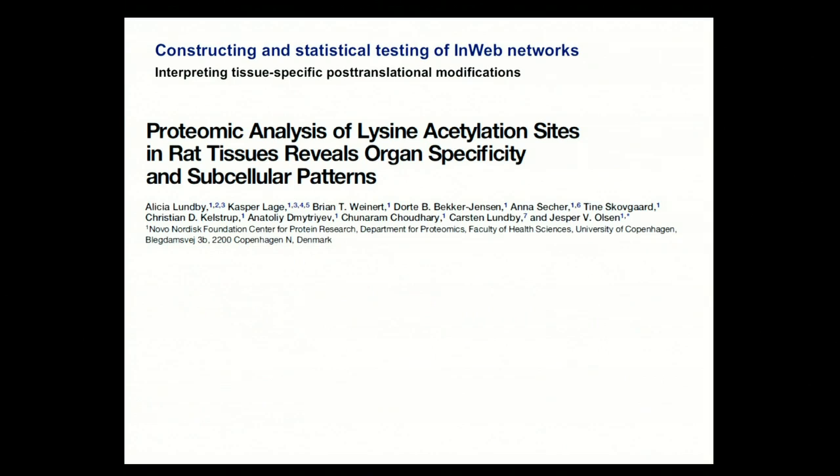But this is an approach we use to annotate and analyze two data sets of post-translational modifications in a collaboration with Jesper Olsen's group in Denmark. And basically they had analyzed tissue-specific acetylation sites across 14 tissues. And the question was, okay, if you have a set of acetylation sites that are seen in brain, do the proteins that have a brain-specific acetylation pattern actually form brain-specific pathways? I think that's the main question. And also, if they do form brain-specific pathways, are those pathways then related to brain-specific diseases? That was what we wanted to know.